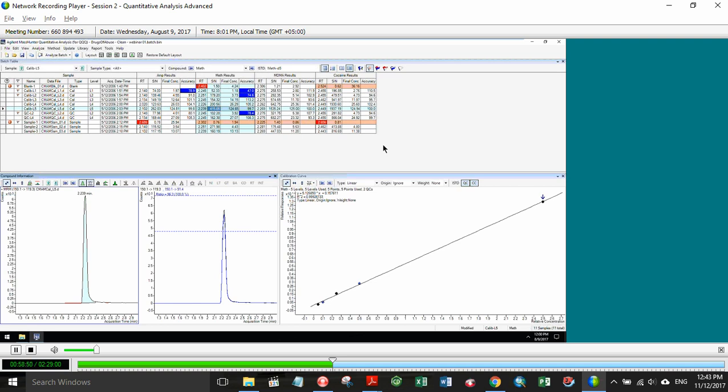Okay, great. Do QCs participate in or influence the curve? The answer to that is no. Your QC and CC is a separate level on the curve, but it is not used for determining the curve itself. They are separate points on the curve, but they are not used.